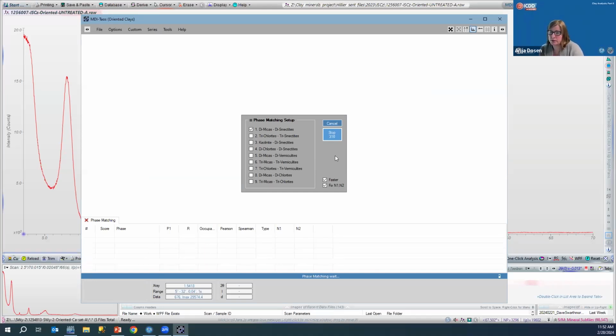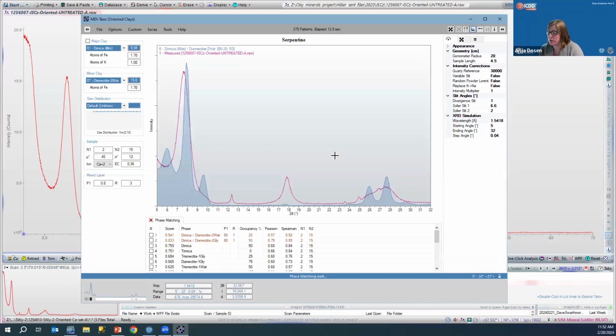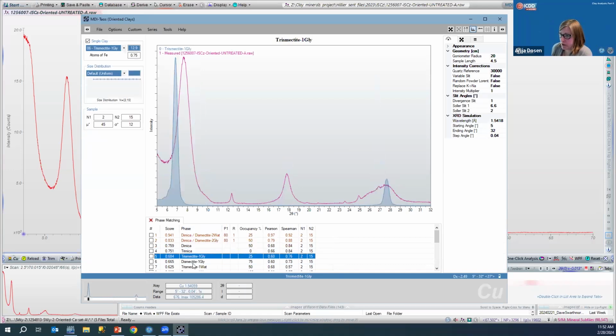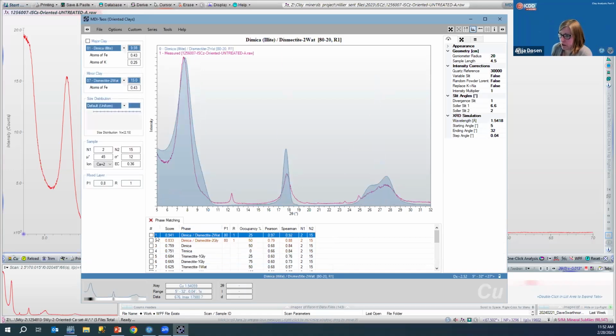In some other case, it can go up to 2000. So now it went to, I think, like 300-ish. So once you start clicking through this list, you're going to see how these chosen clays compare to yours. So I'm going to say this one, and I'm going to find kaolinite here.